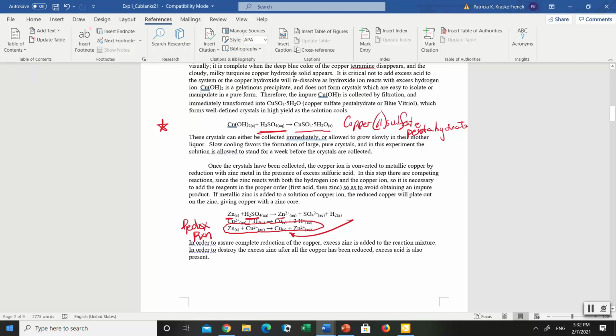We're going to be doing a large number of things today. We're going to be dissolving an ore. We're going to be filtering off any gangue that remains. We're going to be changing that ore into a solid, and all the other tin, zinc, iron, whatever that have solidified as well.